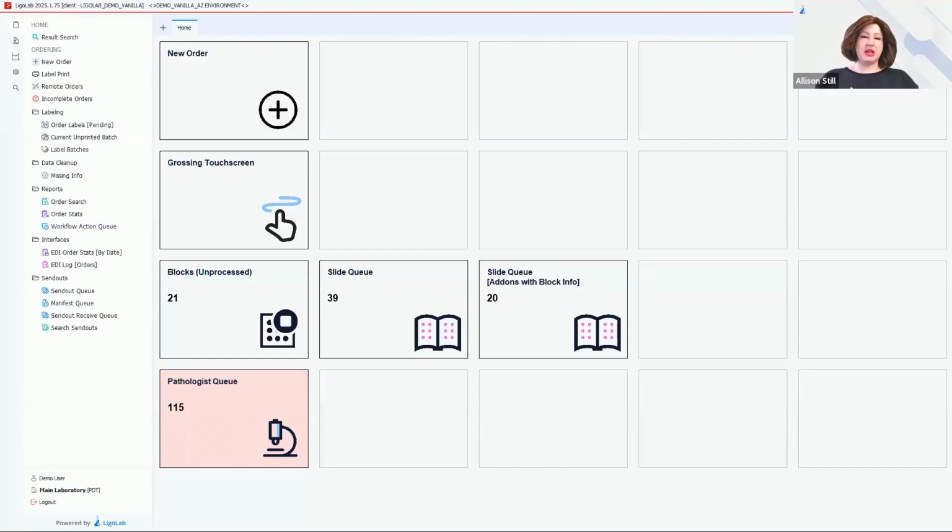Entirely customizable. There aren't too many rules that are shared between customers. When we have new customers, they get what we call the vanilla environment. So if there are any rules that we have previously determined would be useful for many different labs, then there will be some rules pre-configured in that environment. But otherwise, most rules are completely specific to the individual customer or laboratory.